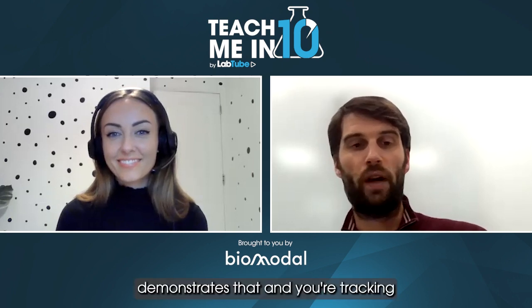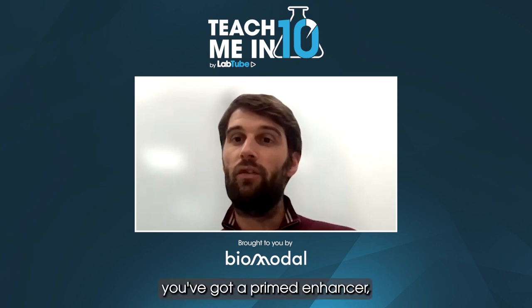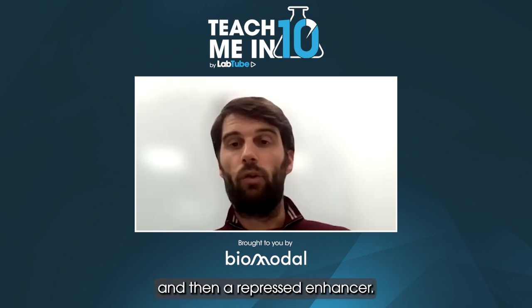And yes, we've got some data that demonstrates that, and you're tracking a repressed state of an enhancer, MC-HMC, where you've got a bit of a mix, you've got a primed enhancer, an area that's about to be switched on, and then a repressed enhancer.